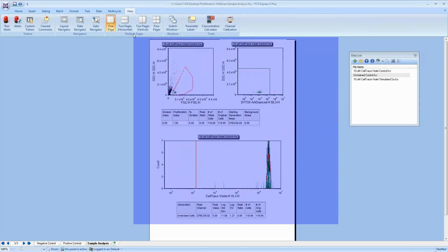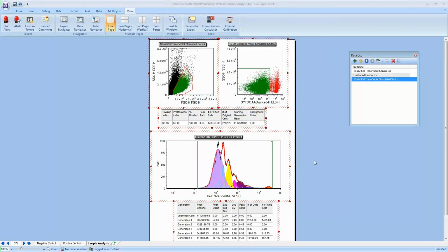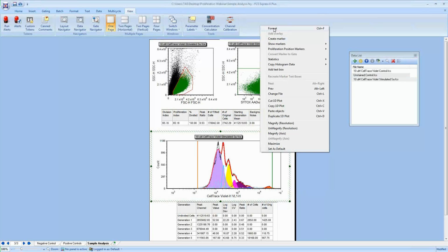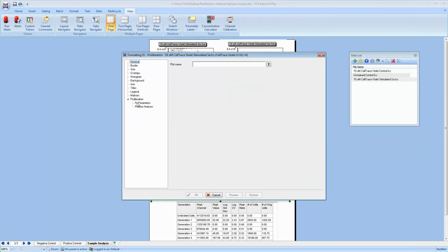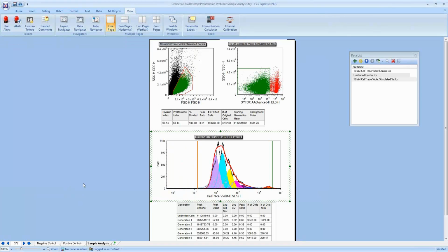We would select these plots, choose that data file, and that's going to update everything. And now we're off and running with our experiment for our new data set. In this case, if you remember, this probably doesn't look so good because we changed our fit parameters to use some different values, and that should look a little bit better.